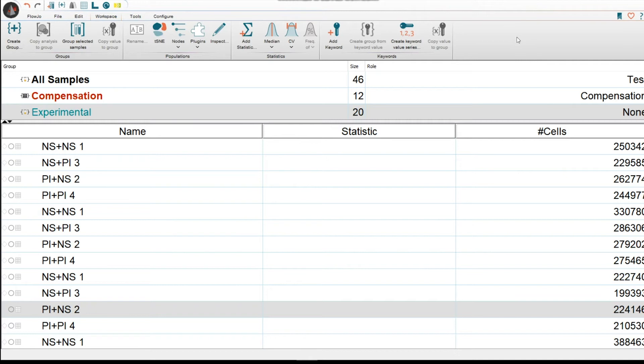Keywords in FlowJo are going to help you organize your workspace, label your parameters with your biological markers of interest, as well as help you report in your reports for stats and graphics for more visualizations.